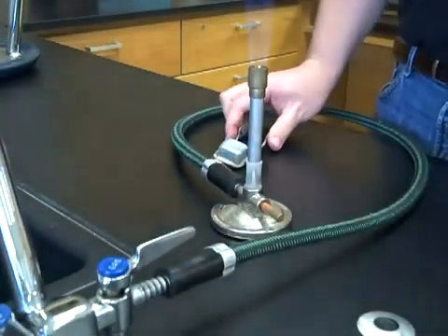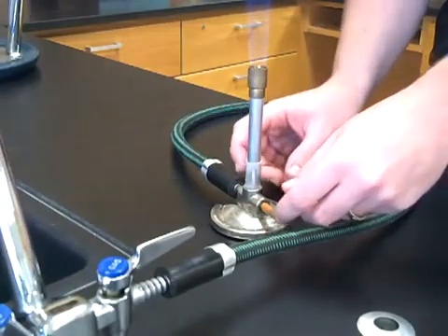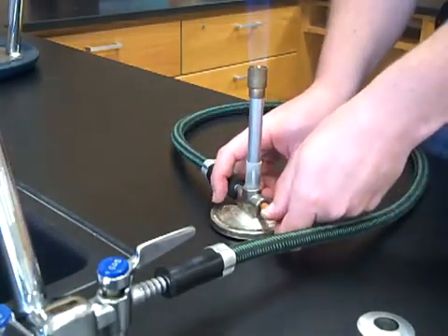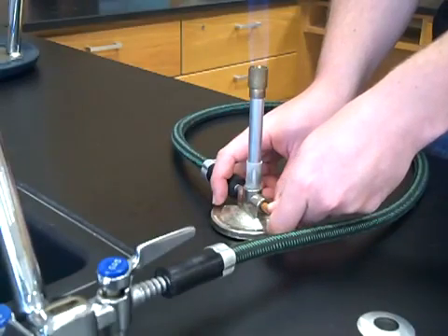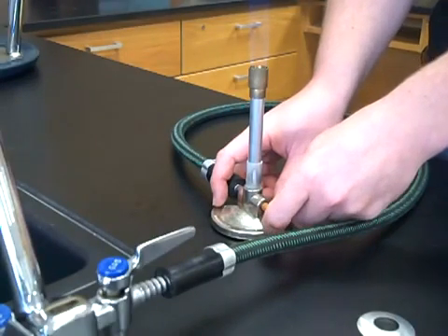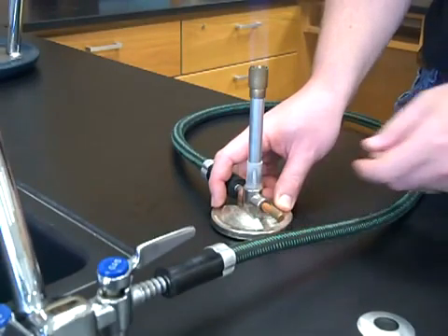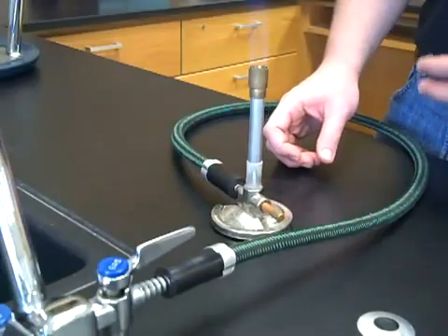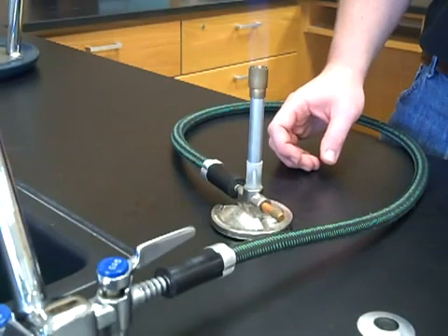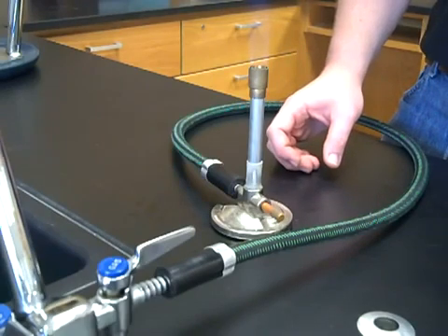At first, your flame might be pretty tall — taller than we really need it to be. Close the needle valve slowly to bring the height of the flame to two or three inches. The sound of the gas coming through may subside a bit. This is what we call a lazy blue flame — it is blue, which speaks to the temperature, and lazy because you can see it pulsating.